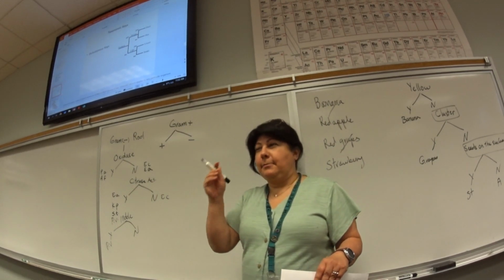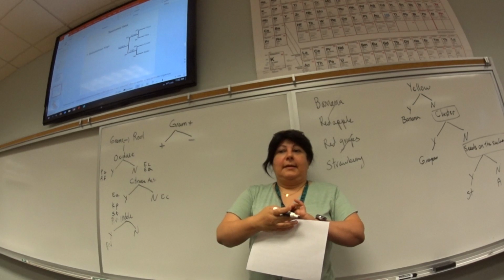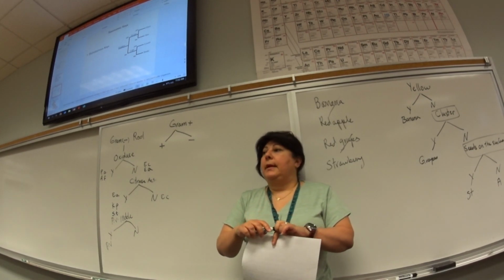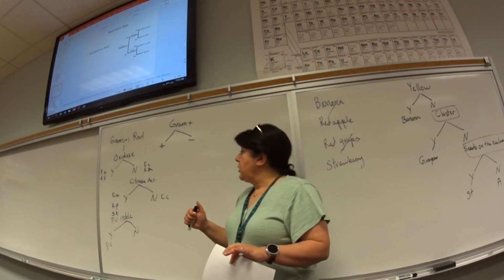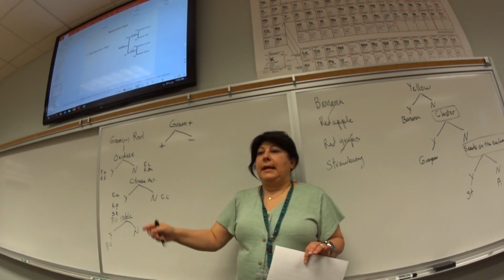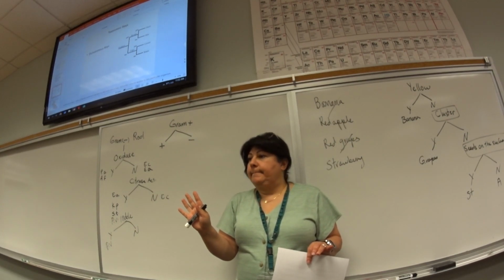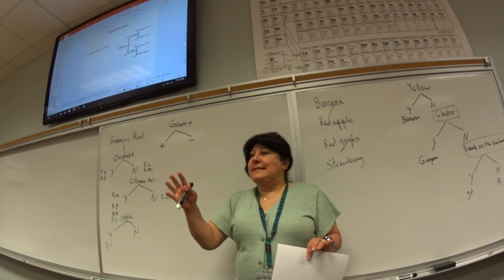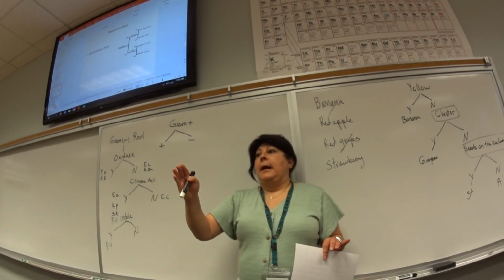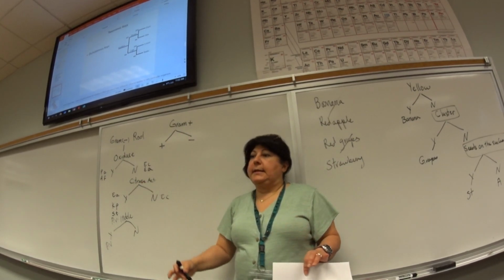Does everybody understand what we're going through? When you play with it at home, it might sound crazy, but you can actually organize the order of the tests any way you want to make your dichotomous key pretty. If the same things are yes for it, like it's indole positive, citrase positive, and all of that, it's just individual, put it in one area.